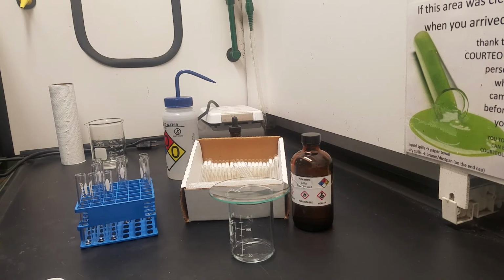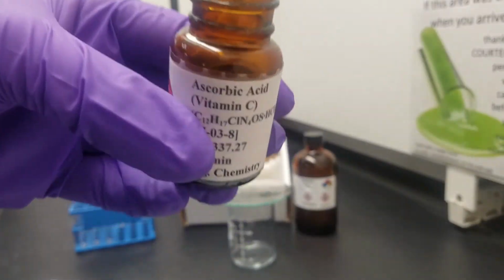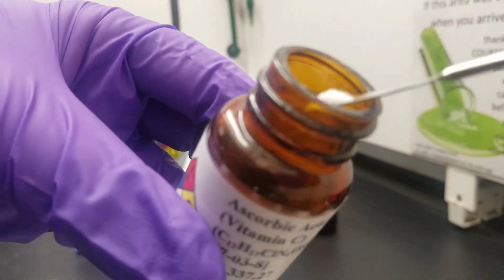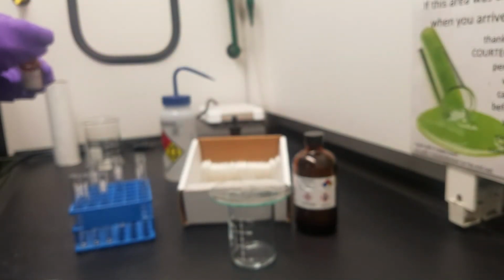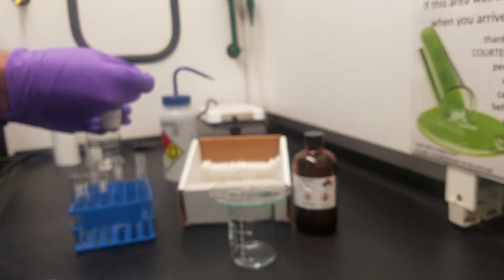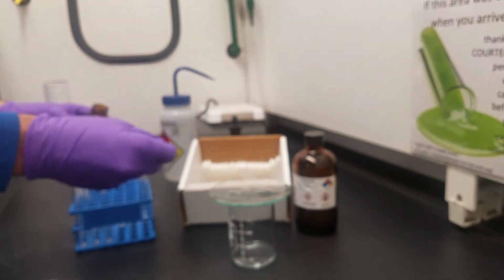This is probably going to be another long stretch of no audio because I'm not sure what else to add. But we're going to test each of these individual samples. The lab asked for 30 milligrams. We don't have to measure that out. We just want to make sure we're not using a lot. Okay, so in this case, I'm using roughly 30 milligrams, and I'm going to dispense all 3 right away. Again, no volatility, no risk of this reacting. I can dispense all of my solid samples at once before having to continue on to the rest of the procedure.